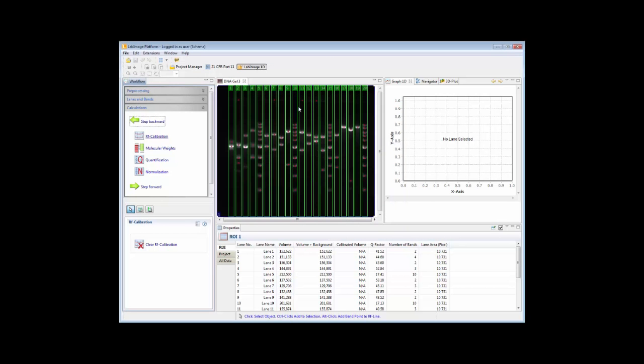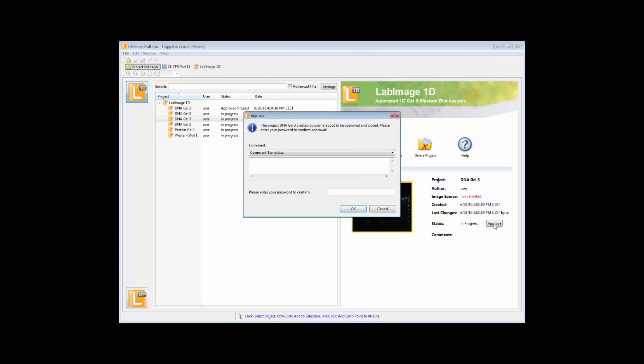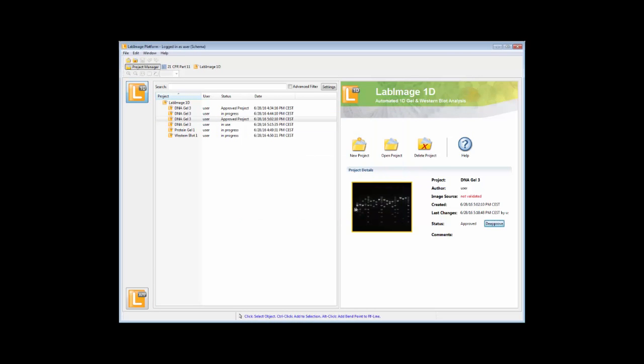If you are done with the processing, you refer to the project manager and you can approve your project by just clicking on the Approve button. You have to confirm with your password. And now this project is in Approved mode, so no modification is possible.